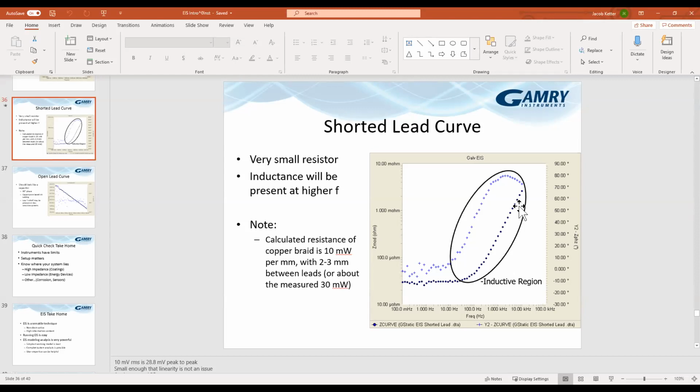There are 2 different equations that convert constant phase element values into capacitance. They give you slightly different answers, and the one that you choose requires you understand the nature of the discrepancy. So you need to know exactly why it's a CPE instead of a capacitor. And then you can use the appropriate response.